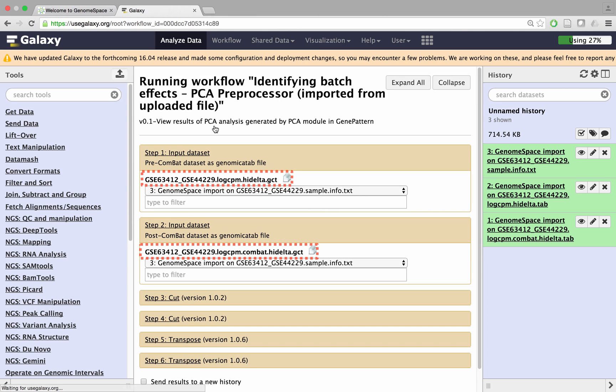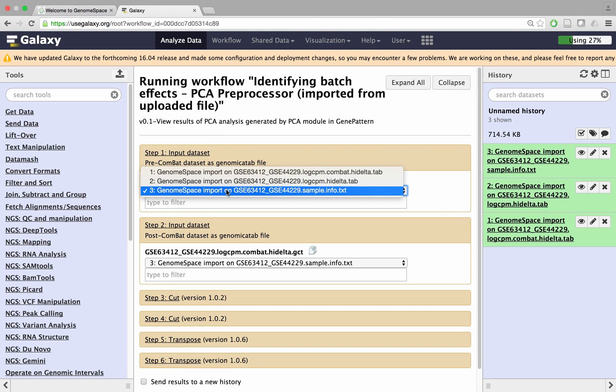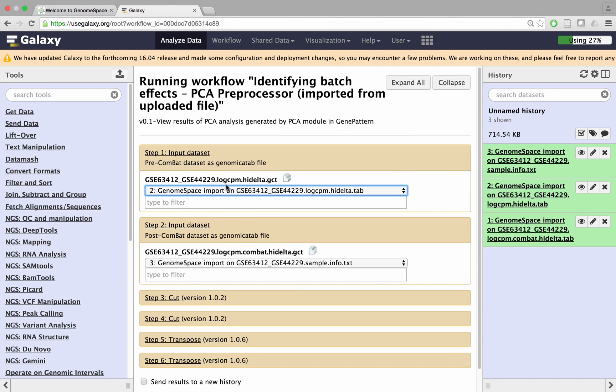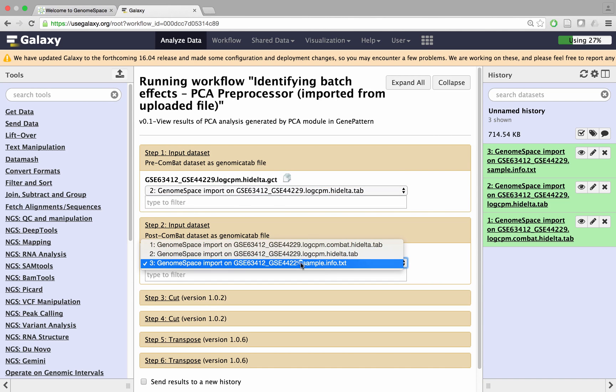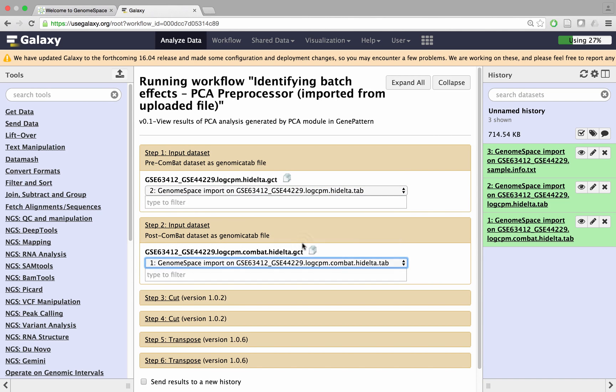Notice that our recipe-associated workflows indicate the names of the files needed for each input. For example, we set the first dataset to gsc-63412-gsc-44229.logcpm.hi-delta.tab, and the second to gsc-63412-gsc-44229.logcpm.combat.hi-delta.tab.